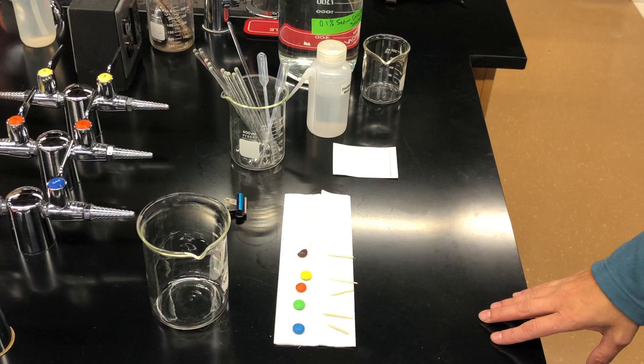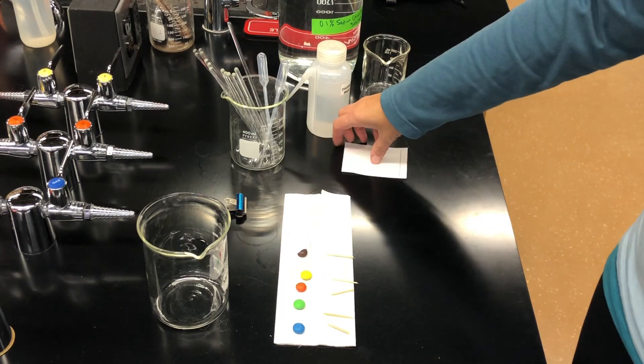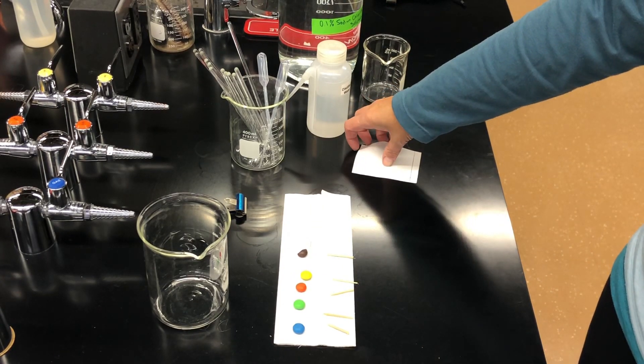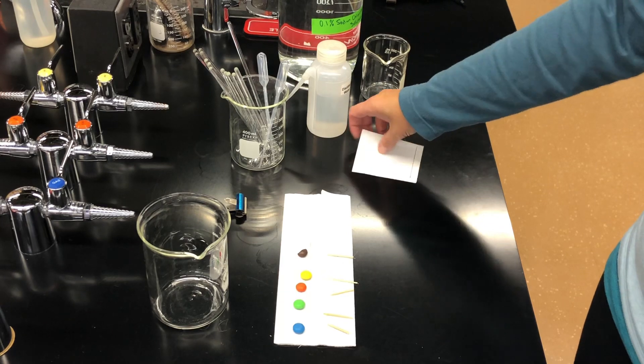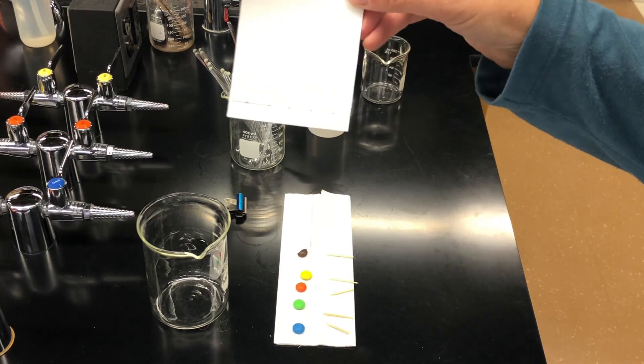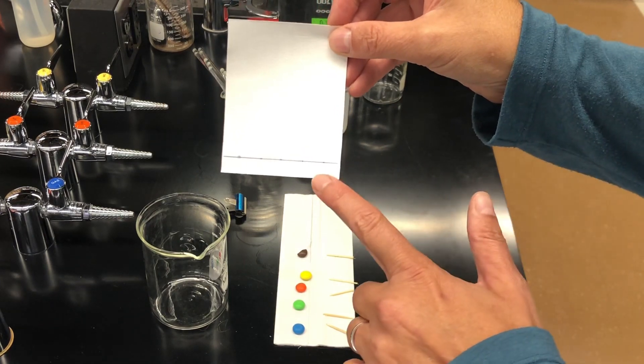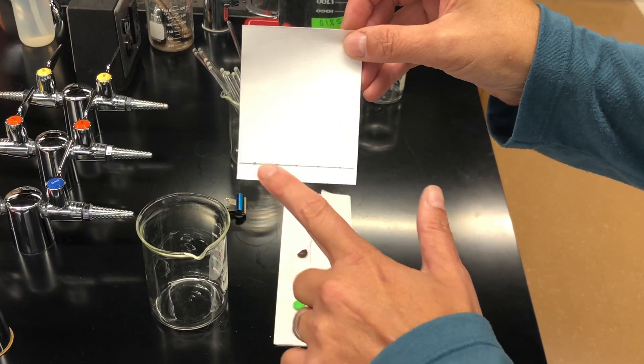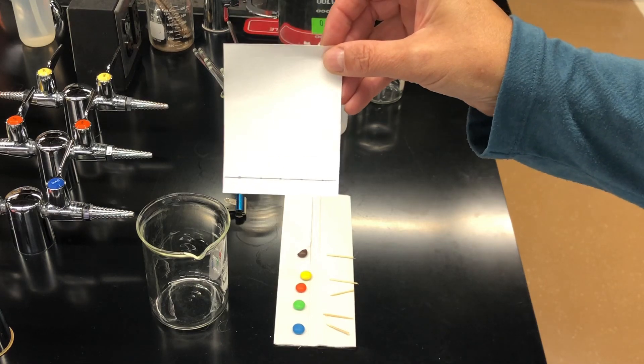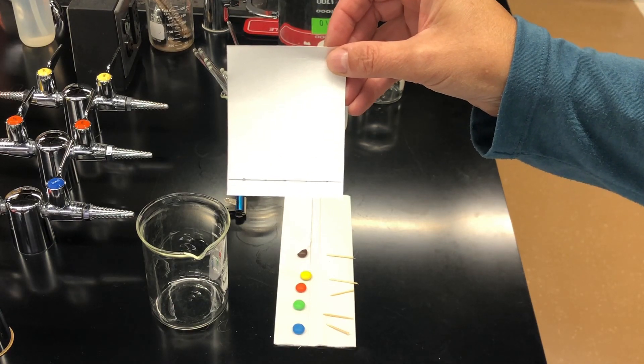Step one, obtain a piece of chromatography paper. Make a line across the bottom using a pencil. There you go. I've already done that. See my line? And I have placed small dots on the line so that I know where to put my marks.